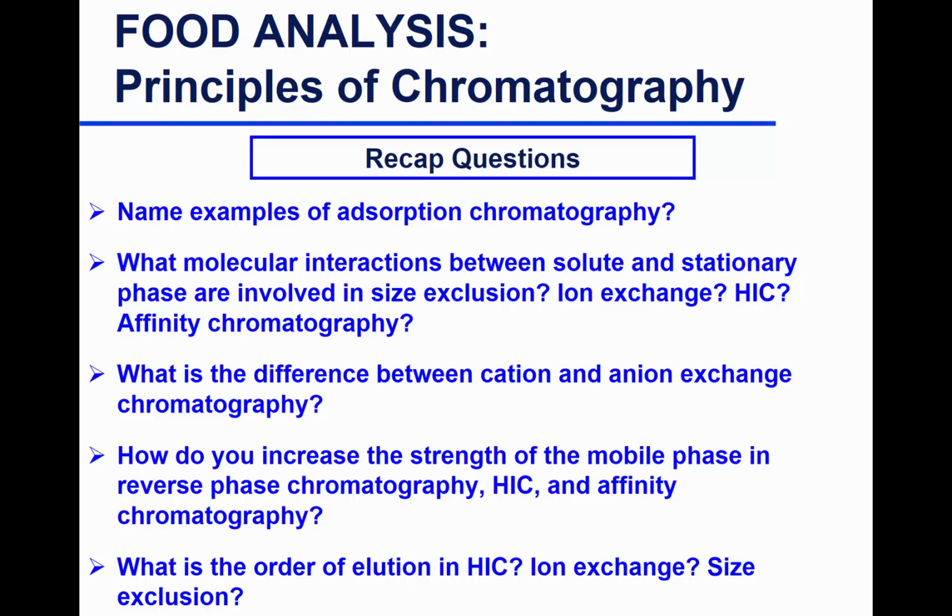So what molecular interactions between solute and stationary phase are involved? We already said nothing for size exclusion. Ion exchange? Electrostatic interactions. Size exclusion, we established that, yes, nothing.